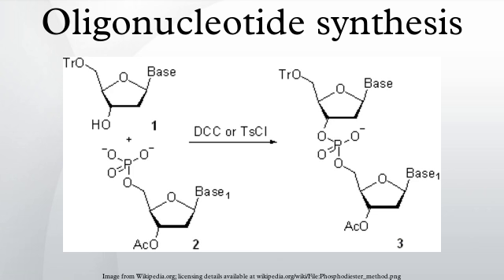Linker chemistry. To make the solid support material suitable for oligonucleotide synthesis, non-nucleosidic linkers or nucleoside succinates are covalently attached to the reactive amino groups in aminopropyl CPG, LCAA CPG, or aminomethyl MPPS. The remaining unreacted amino groups are capped with acetic anhydride. Typically, three conceptually different groups of solid supports are used. Universal supports.